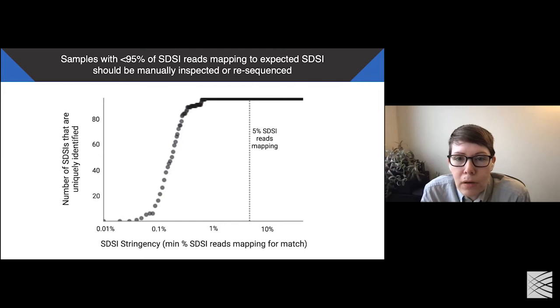We explored our SDSI mapping stringency threshold by determining whether each SDSI was uniquely identified over a range of SDSI stringency thresholds. For an experiment where we had sequenced the SDSIs without any clinical samples, we calculated at each cutoff the number of SDSIs, seen here on the y-axis, out of the full set of 96 for which only the expected SDSI had a proportion of mapped reads that exceeded the cutoff seen on the x-axis. Assuming no contamination, all 96 SDSIs should be identified uniquely. That is, no other SDSI should have a proportion of mapped reads that exceeds the cutoff. So the dotted line here at x equals 5 percent represents the stringency cutoff that we recommend in practice to detect contamination events.